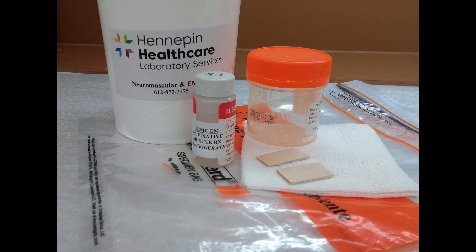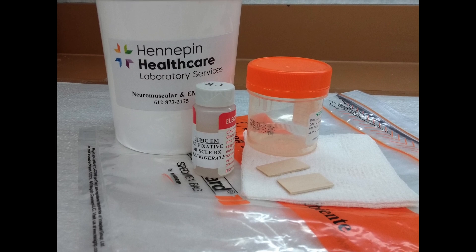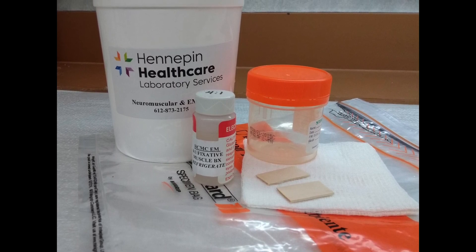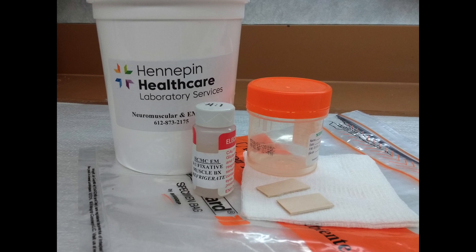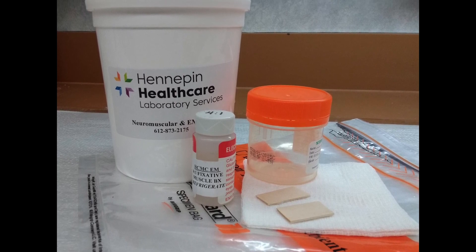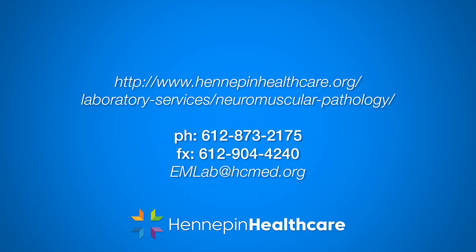Our lab is happy to supply fixative and kits for packing muscle and nerve biopsies. Please contact our lab when the biopsy is initially scheduled so we can make sure you have everything you need. This also allows us to ensure we have adequate staffing ready on the day and time of the biopsy to snap freeze and process the tissue as soon as possible to minimize the risk of freezing artifact or degradation. Feel free to contact our lab with any questions, and thank you for helping us get the most clinical information out of every biopsy.